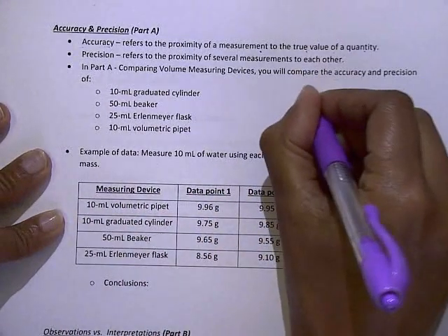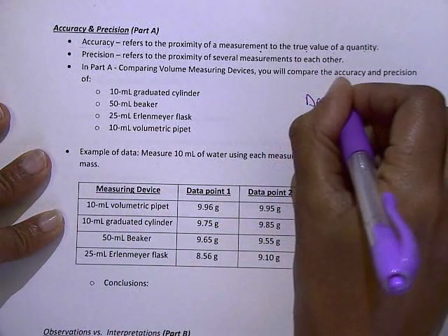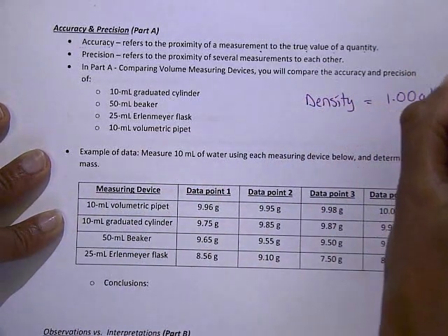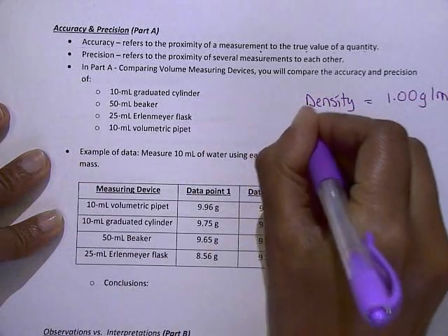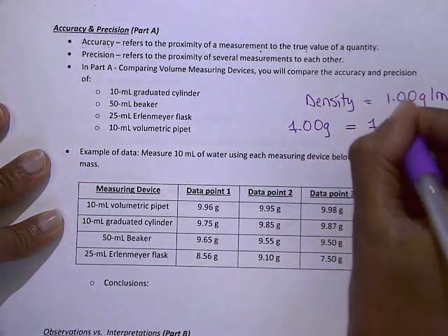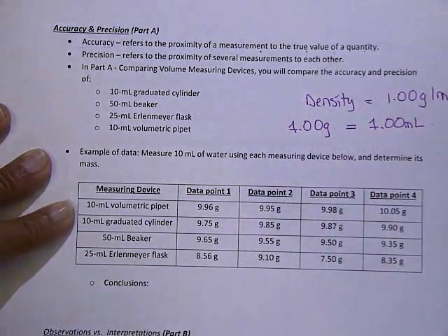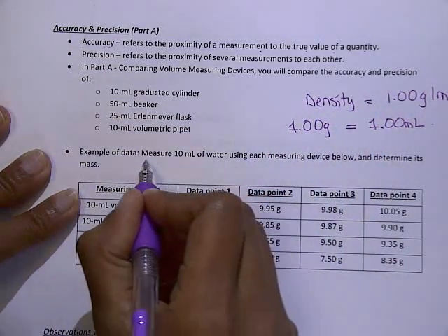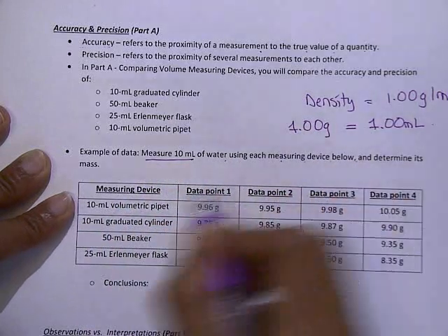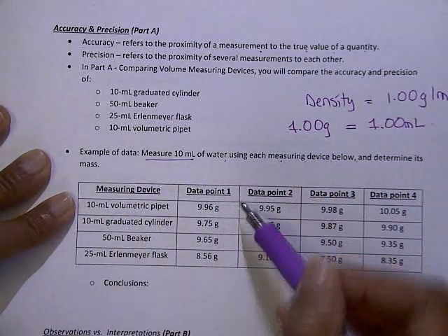Just to backtrack a little bit, water has a density of 1.00 grams per milliliter, meaning theoretically, if you measure 1.00 grams, this should equal 1.00 milliliters. So what you're doing in lab is you're going to measure 10 milliliters of water using each of the measuring devices below and determine their mass.